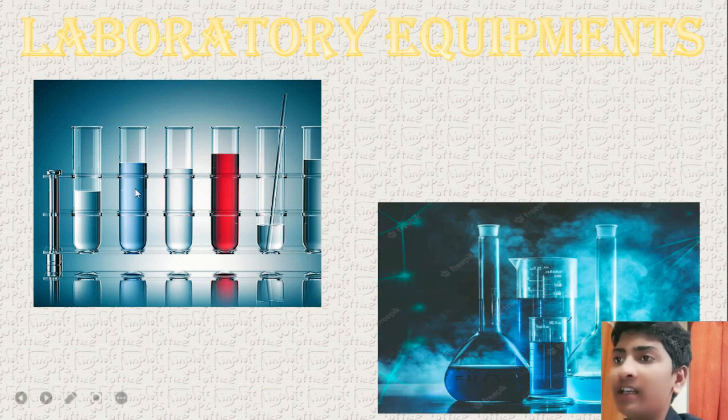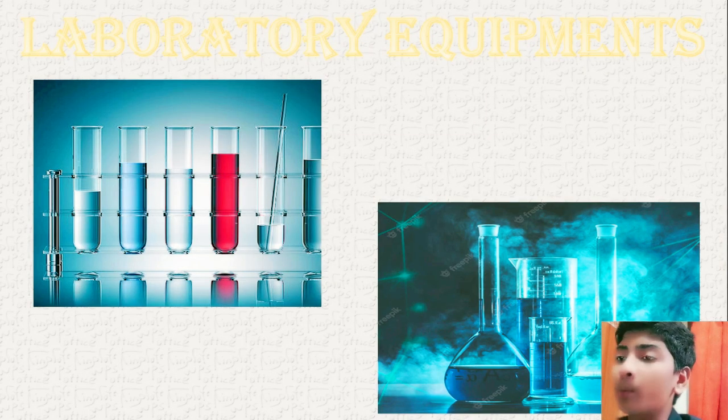See here. Here they stored some chemicals in the test tubes, or here they need to mix this with this stick, and here they stored some chemicals in these. Now let's discuss separate equipment with separate uses.